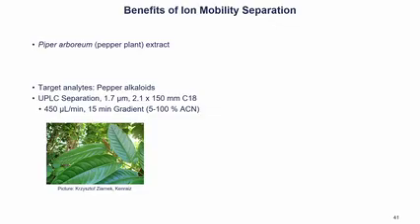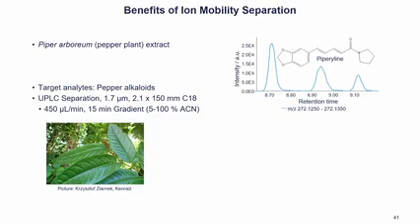And what we noticed is that some of the alkaloids that we are interested in have structures like this. So they have 2 double bonds next to each other. And so they can form cis-trans isomers. And although it's possible to make 4 different cis-trans isomers when you have 2 double bonds, we see only 3 peaks in the chromatography dimension.